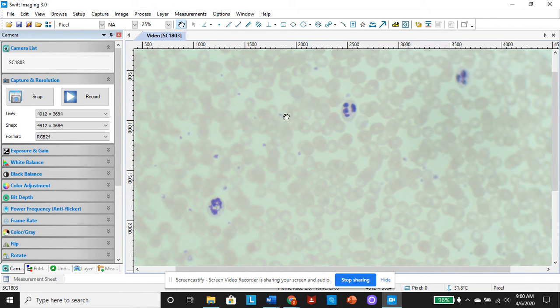They're only purple from the stain, but it's a ton of these little platelets that come together and form a clot or a scab that keeps you from bleeding. Isn't that neat? Just these little guys. And there are some chemicals in there that help them cross connect.